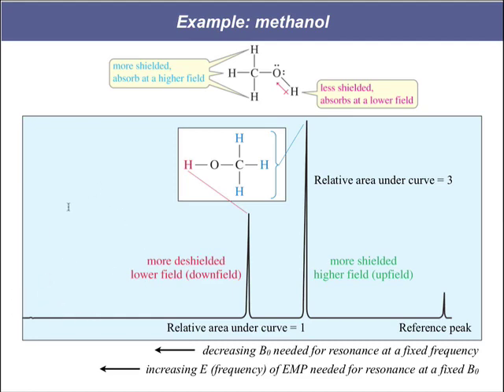that means that these signals come from deshielded protons. If they are deshielded, that means they feel a significant amount of the external magnetic field, and therefore that their spin states will be very different in energy. So you can also think of this as increasing energy needed to achieve that resonance. We need to apply a greater frequency to correspond to that delta E between the two states.